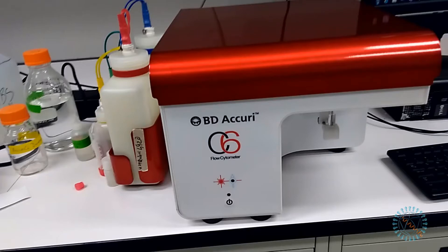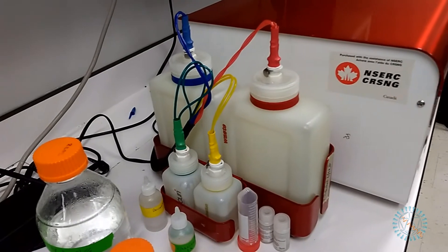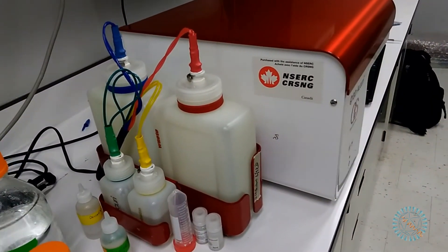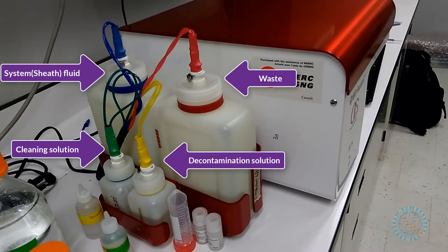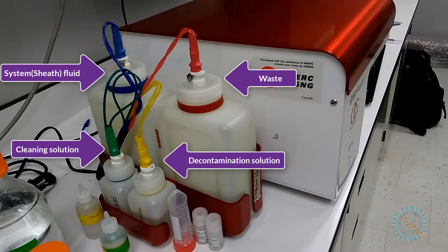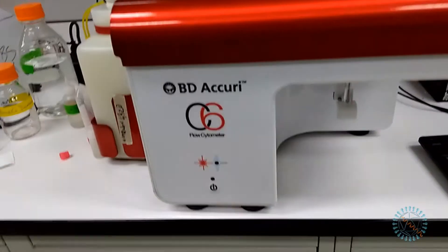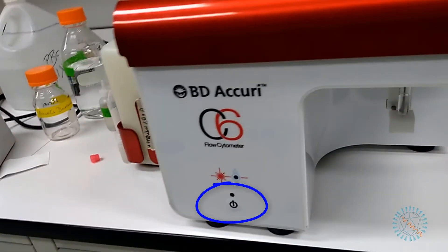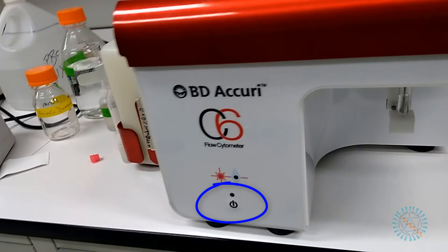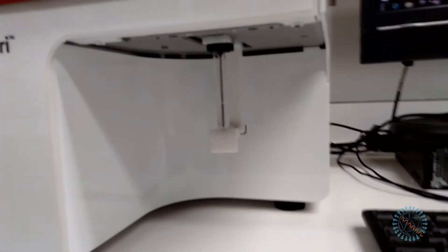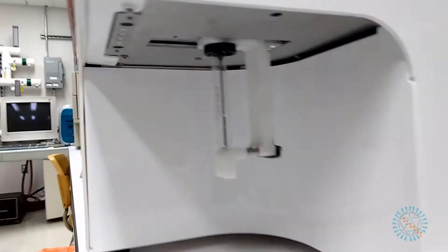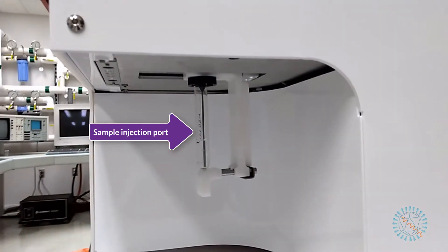But let's get back to the Accuri C6 cytometer so I can show you its parts. As I said before, the instrument is fairly simple. On the left hand side we have containers for the system fluid, the waste, the cleaning solution, and the decontamination solution. Moving to the front, we have a single button used to turn the equipment on or off and when needed activate the cleaning cycle. On the right hand side we have the sample injection port and the sample stage which can accommodate several types of tubes including any brand of 12x75mm tubes and most microcentrifuge tubes too.